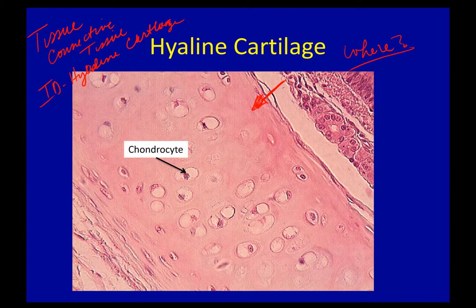Hyaline cartilage has the ability to give structure, but it's flexible structure. I can go up and squish your nose and it's not like it stays that way. It'll pop back. You can't really do that with the skull. You can't just squish the skull and hope it pops out. With cartilage, though, the rubbery consistency allows you to do that.